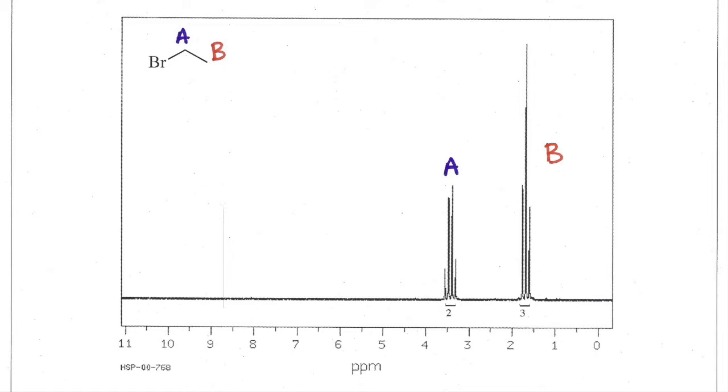This peak happens to be a little bit higher in the alkyl region than a typical methyl group, but that's okay. That shift occurs because those protons are not so far from the electronegative bromine. Our proton ranges are approximate, and the exact structure will determine the chemical shift that we see in any particular spectrum.